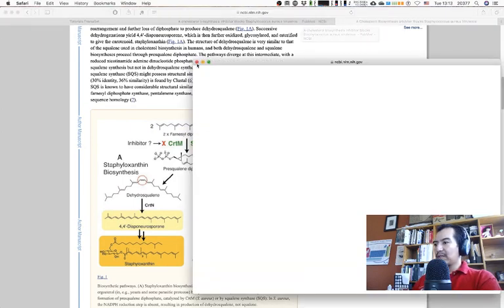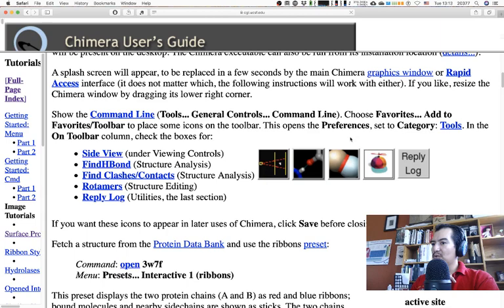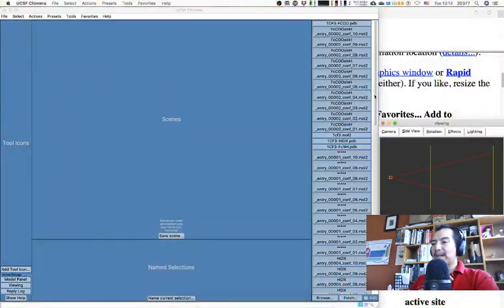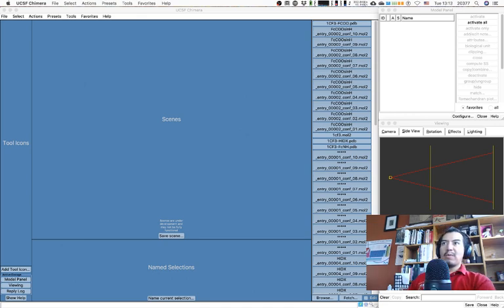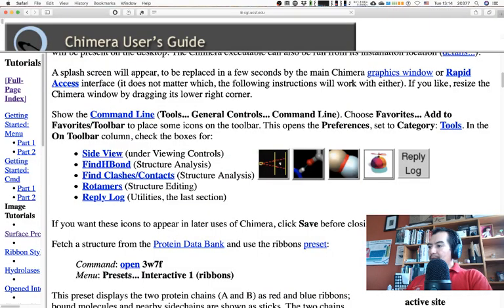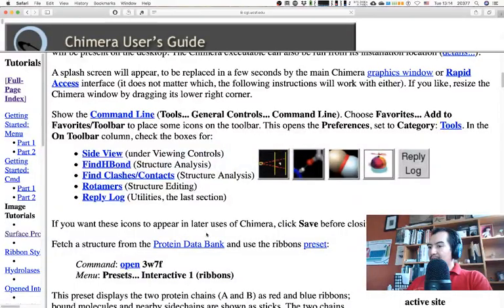We will view and compare different structures of this enzyme. Let's start Chimera — please go ahead and do it yourselves. I've already done my setup the usual way: I have my main view on the left, then on the right the model panel, the side view, and the reply log. Your mileage may vary; you can set it up however it's useful for you. I'm going to open the command line — remember it's usually in Favorites, so you just add it there.